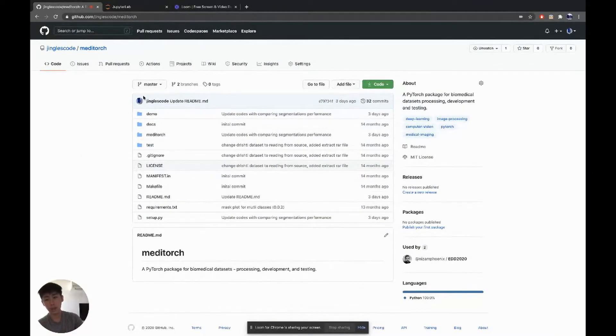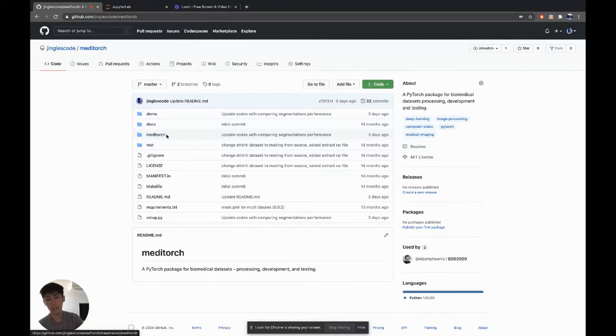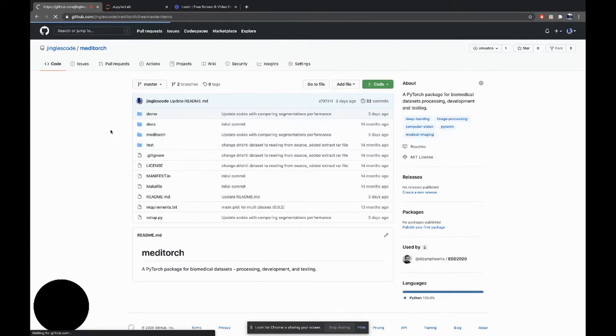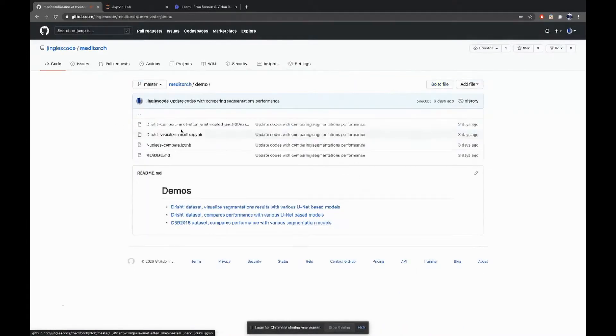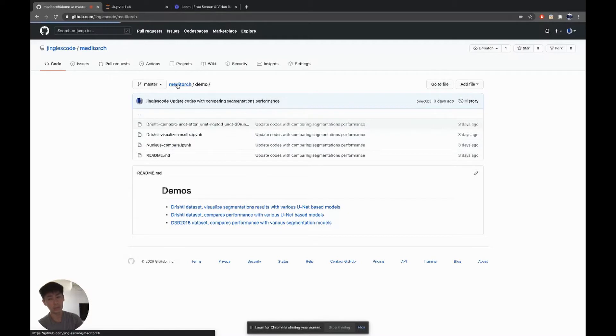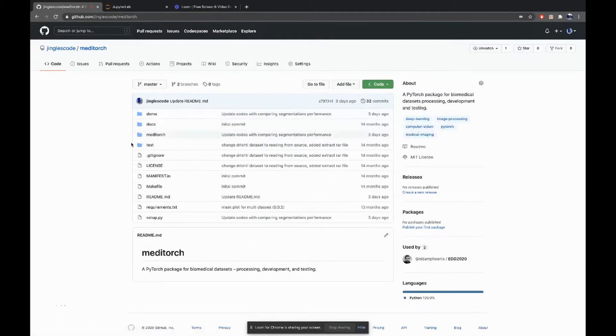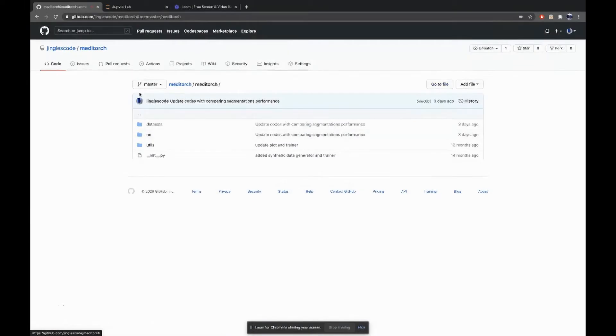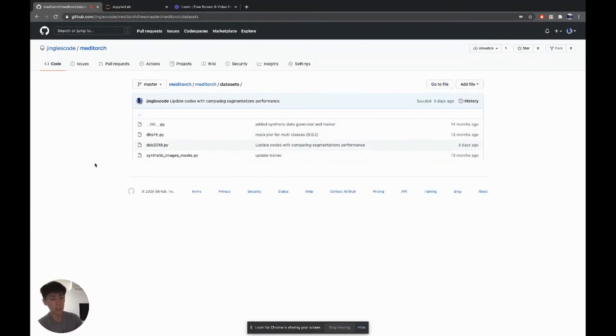Let's go through the code. I package it in such a way that it is reusable and also reproducible. All the notebooks are here where assignment 1 and assignment 2 are here. So it's easy to reproduce. I package it in this package called MediTorch. So let's explore this.